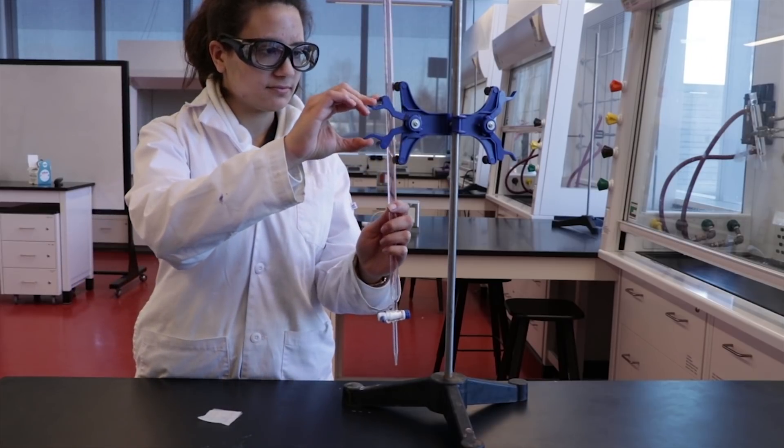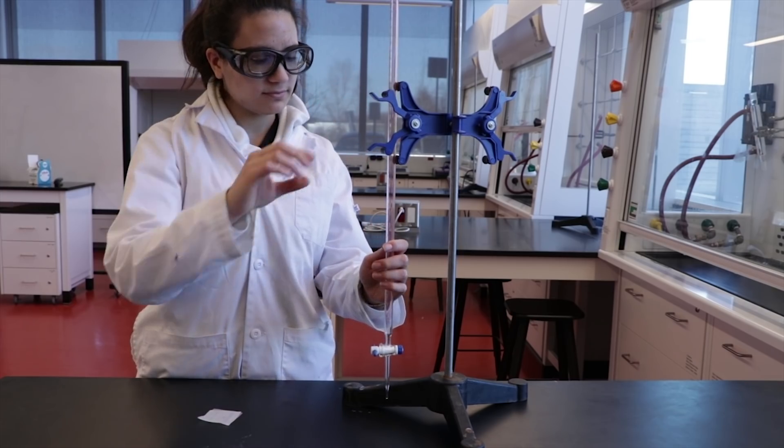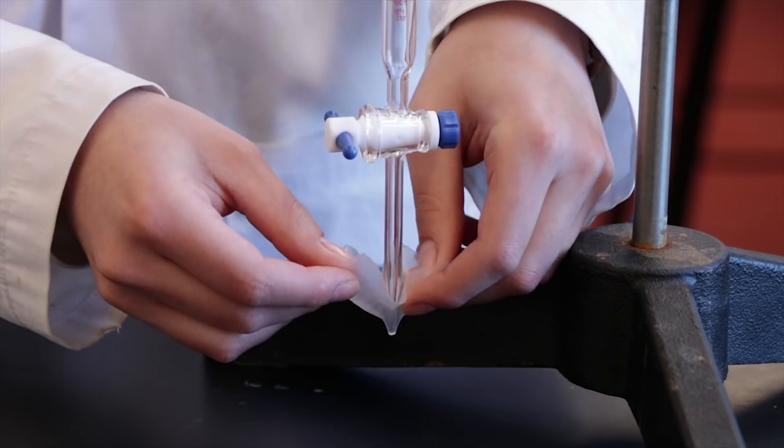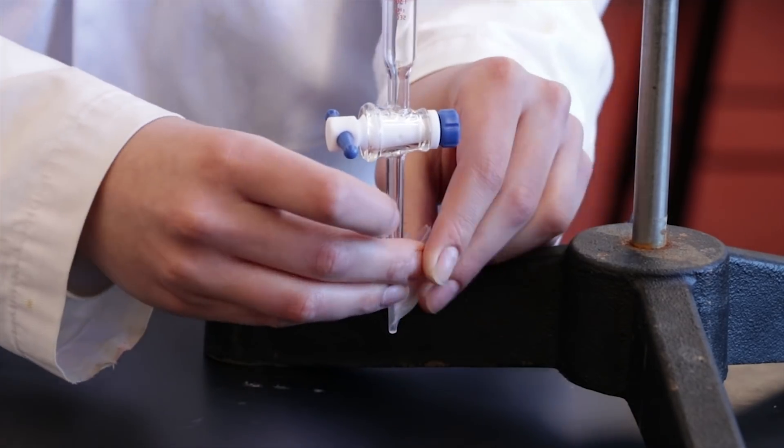First, securely clamp the burette into place using a butterfly clamp. Before the experiment, stretch and wrap a piece of parafilm on the tip of the burette to ensure that your burette is airtight.